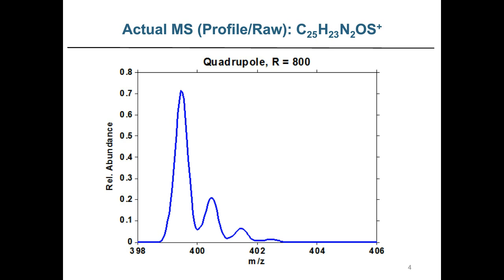But it's very important to understand that the actual data that is collected from any mass spec instrument is a continuum. It's a continuum scan, which is typically processed and eventually presented to the user as centroided data. It goes under a number of different names depending on the vendor and who you're talking to, but it's typically known as profile or raw scan data.